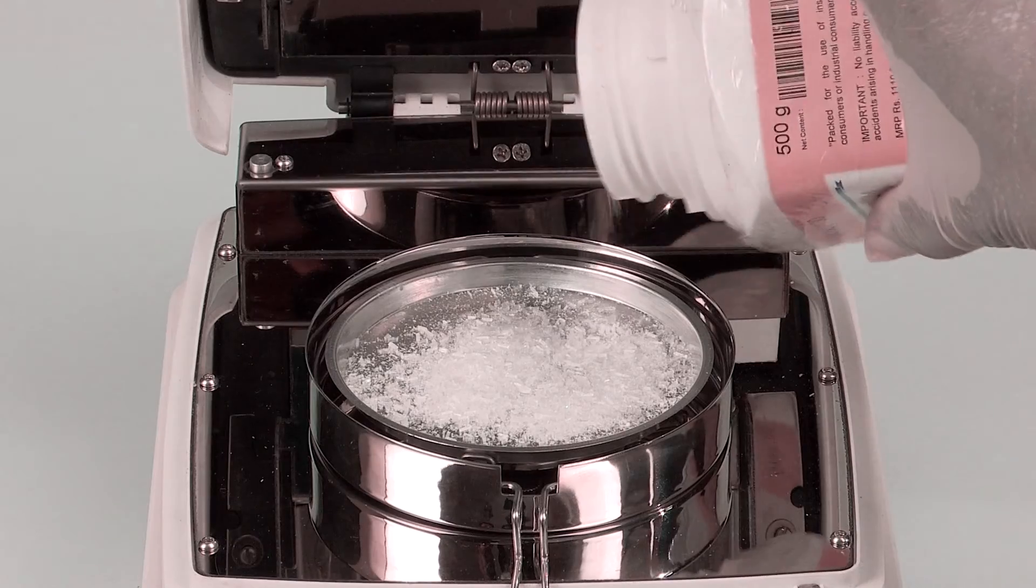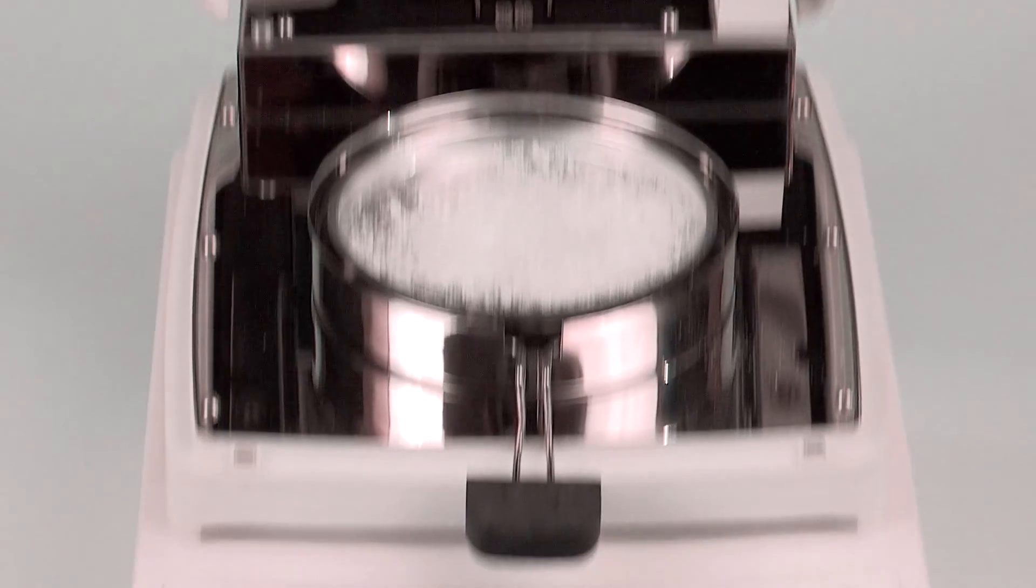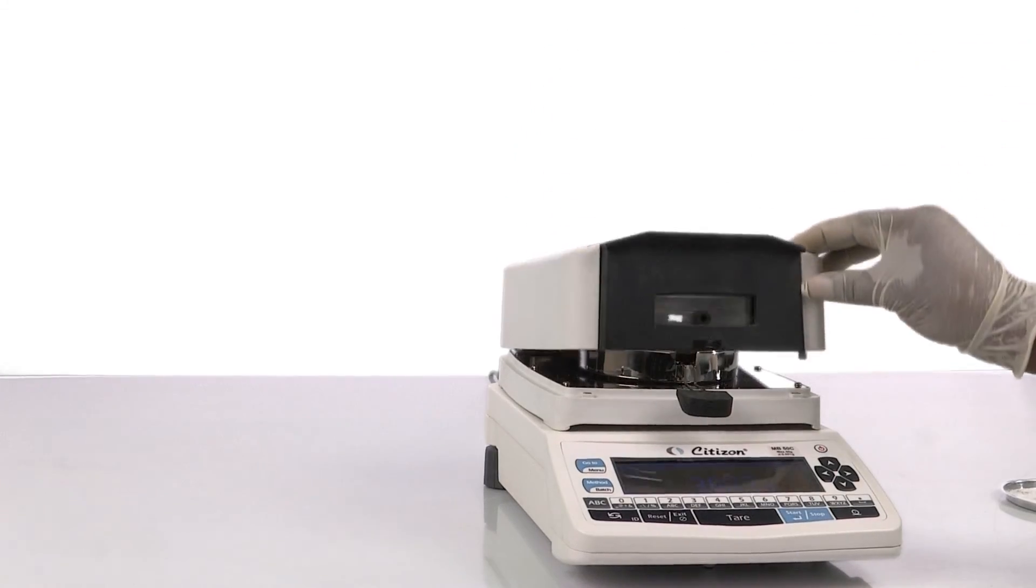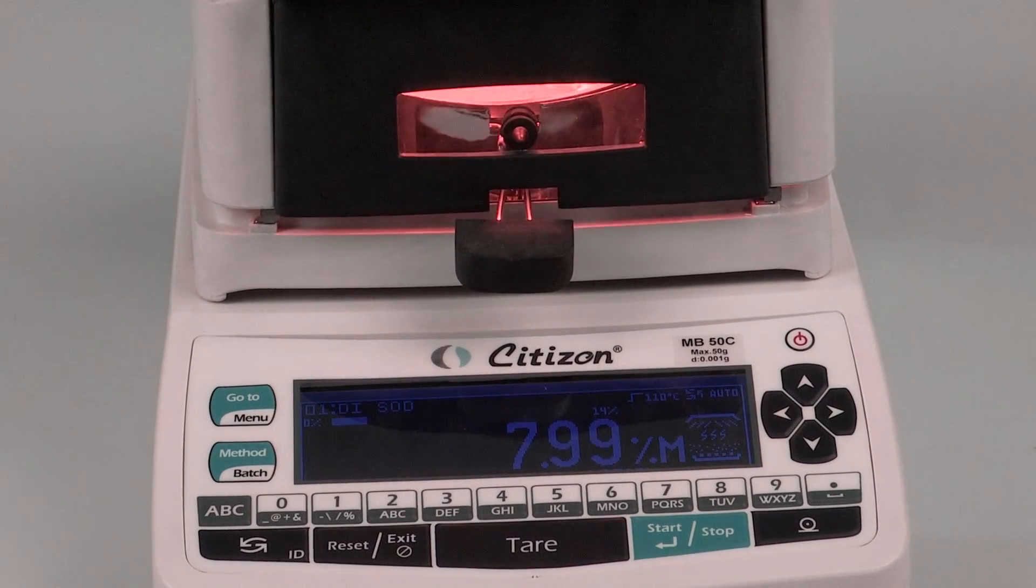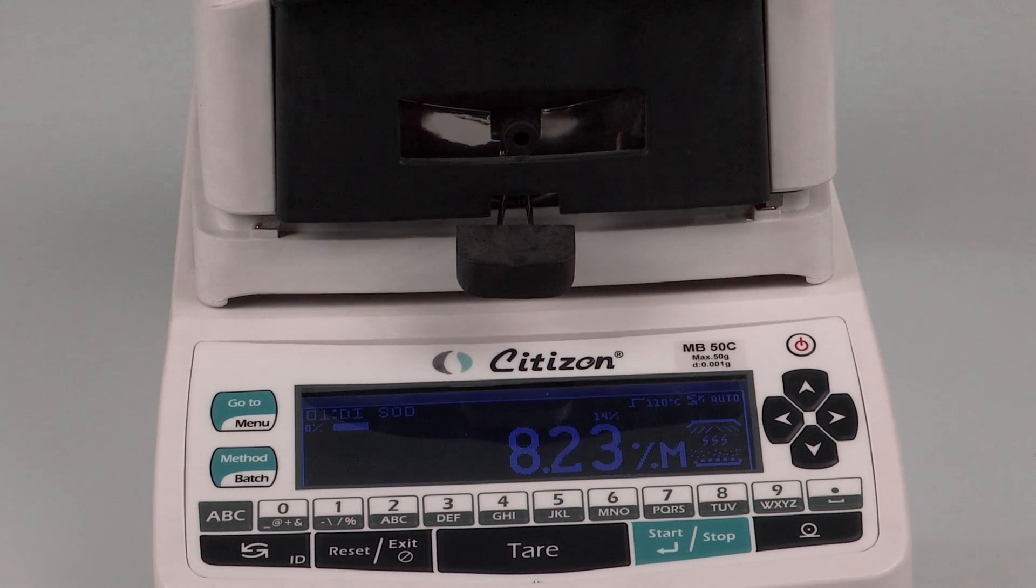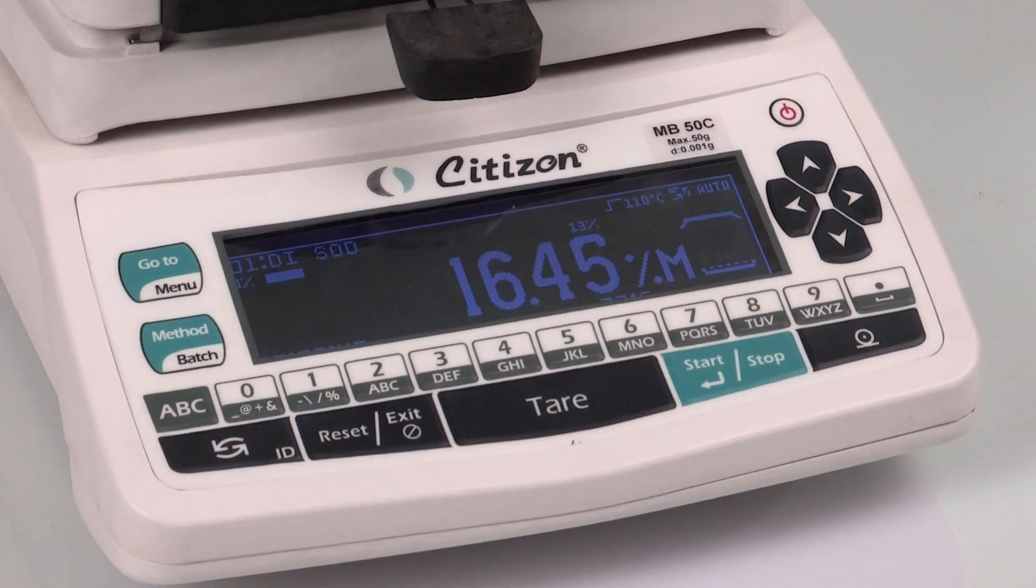The intelligent function is smart enough to analyze and suggest the appropriate parameters for the particular samples including the heating profile, switch-off criteria, and the ideal temperature for moisture determination for the particular sample, all by itself.